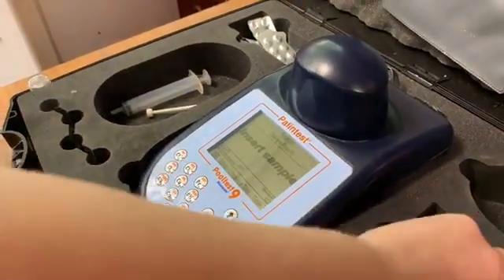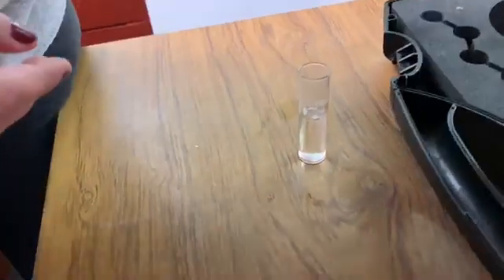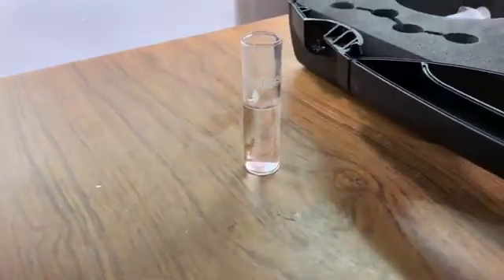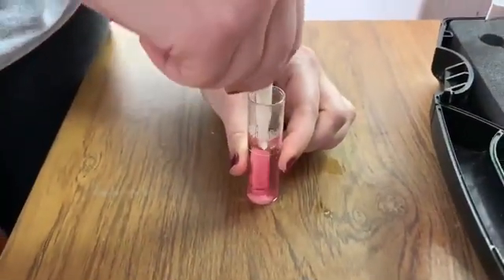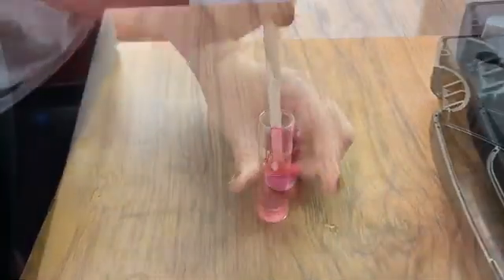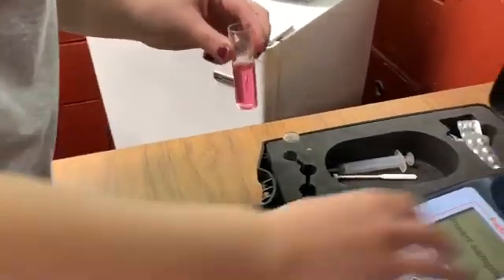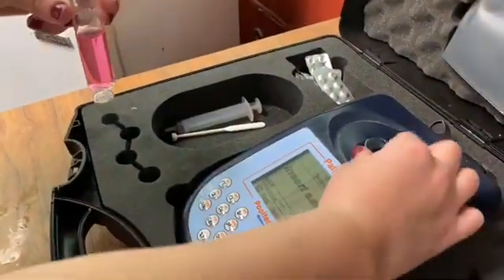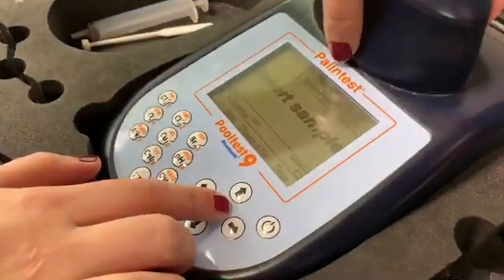After it has finished blanking, you will then use the chlorine tablet, DPDXF, and insert the tablet into a sample. You will then use a stick mixer to crush up the tablet and then let it sit for two minutes. After your sample has been sitting for two minutes, you will then mix it a final time before putting it into the Palin test. Remove the blank and insert your sample and press OK to test.